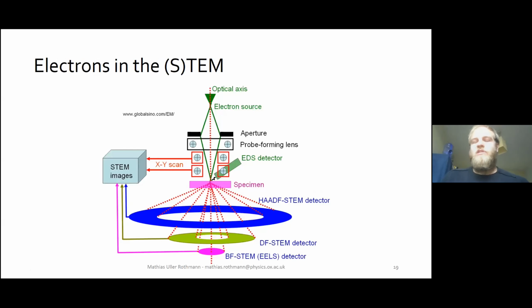But what I'm going to focus a bit more on is TEM, because that's really the trickier of the techniques. My supervisor used to tell me for my PhD that you can learn SEM in a week, but it takes a PhD or more to learn TEM, and I'm still learning. So yeah, it's very true. There's a lot of stuff you can play with.